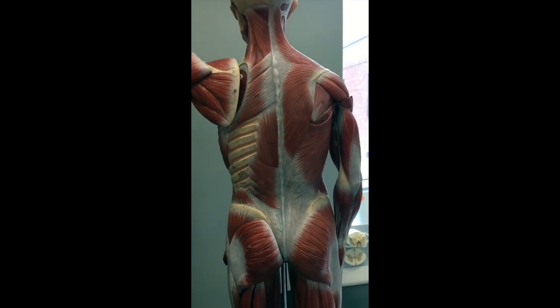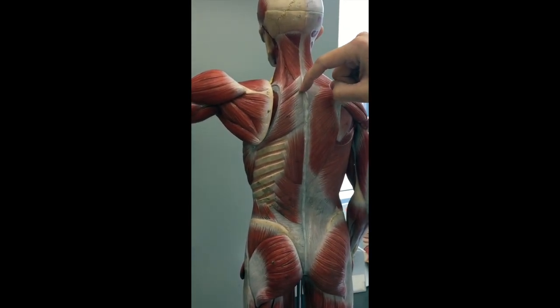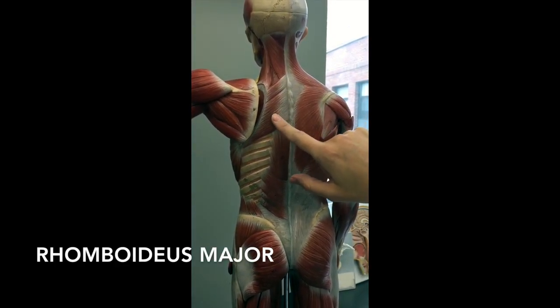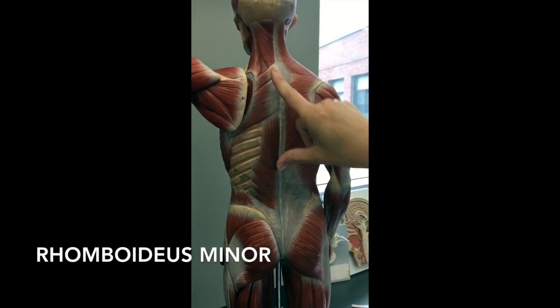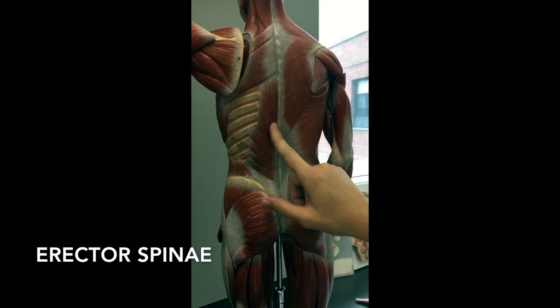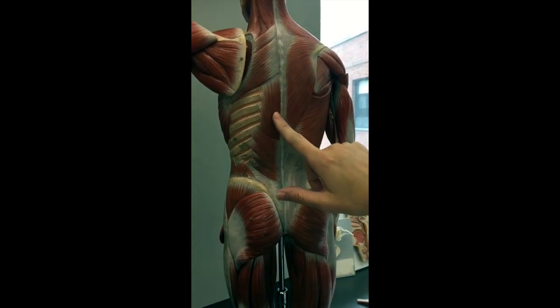If you rip the trapezius off and look underneath, you're going to see there's a smaller muscle here, a little border, and then a muscle right here. The bigger one is going to be your rhomboideus major, and the smaller one will be the rhomboideus minor. Last but not least, still underneath the trapezius on this side, you have the muscle that runs straight along the spine — this is going to be your erector spinae. When this muscle contracts, it keeps your spine erect. So erector spinae is here.